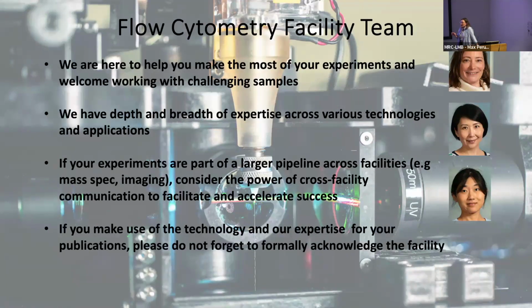It's really helpful for us to understand why you're sorting and what you're doing with the cells after, because again, based on all the things that I discussed today, we will tweak things to maximize that success.